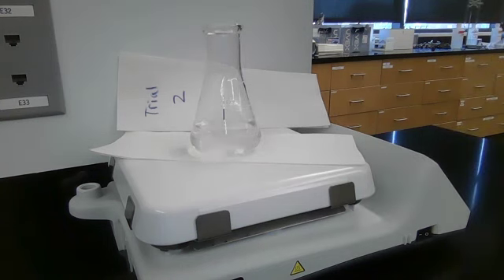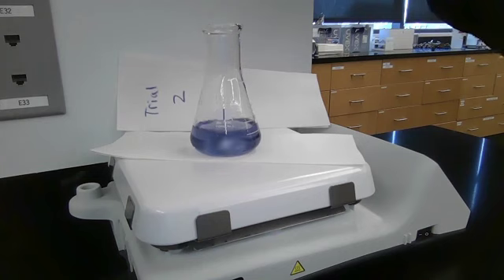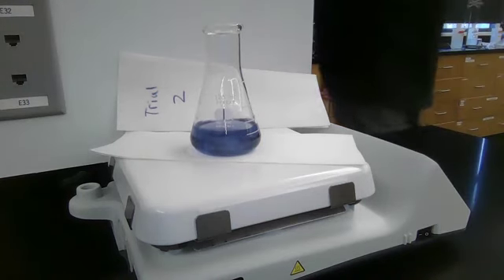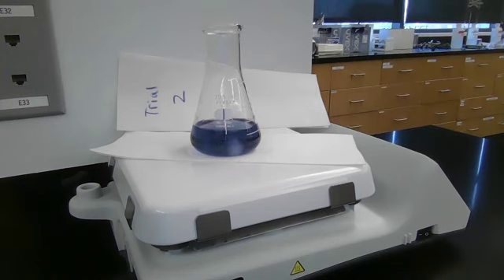Oh, am I seeing some tint? Maybe. I definitely am seeing some tint. Yeah, can you see it on there? I believe you can. You should have stopped it back then when we first saw it, but you can replay this and get your proper time. Look at that. I think 7 drops of starch was pretty good. It's nice and blue. Oh, that's gorgeous. Good work. That was a nice trial.